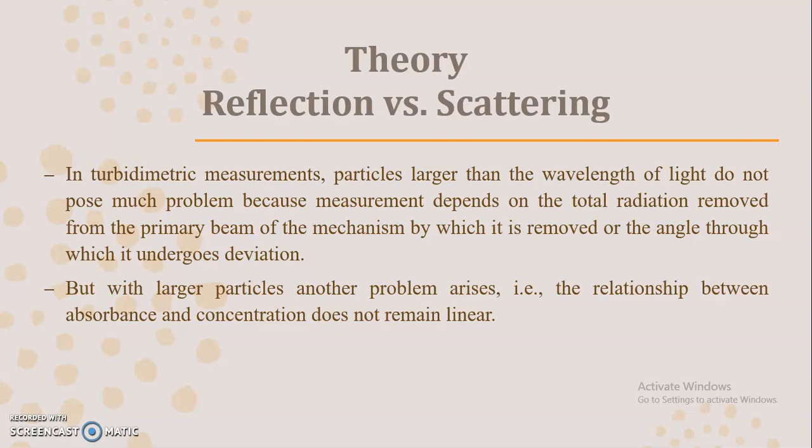So in turbidimetric measurements, particle size does not create too much problem, because measurement depends upon the total radiation removed from the primary beam. That's why particles with a larger size do not create any problem. So this is about reflection versus scattering.